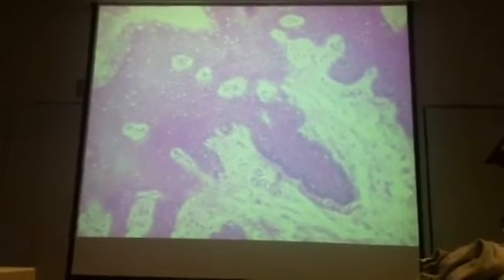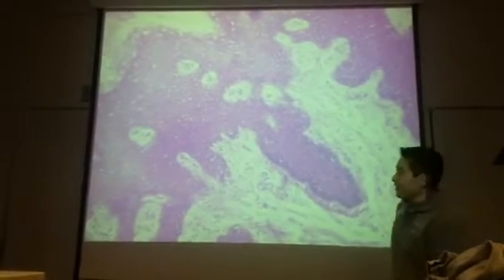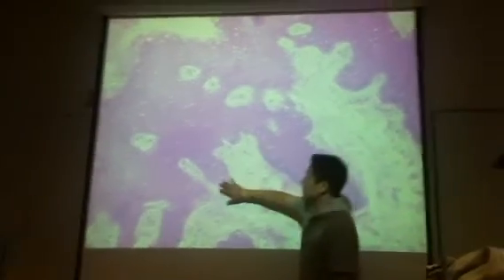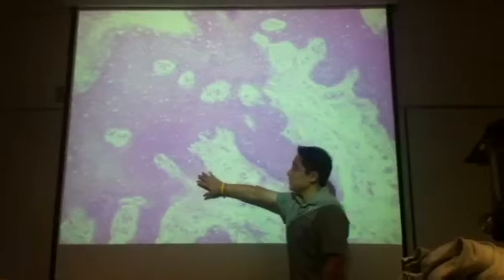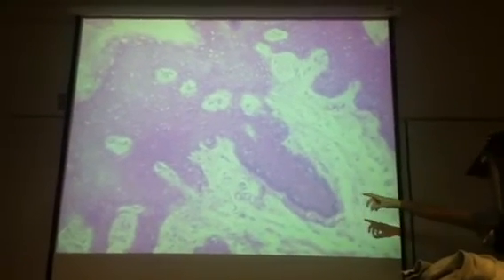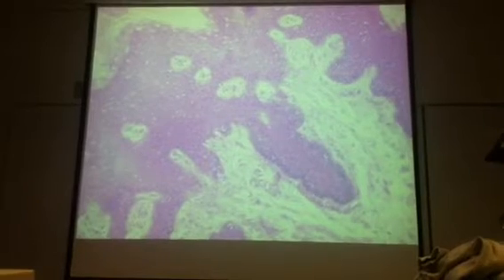They may have some lines like this. They are pretty difficult to find, especially on these slides — they're not as distinct. But they have that kind of spherical head-like structure, and then they have an extension coming out the back. And they recognize what type of stimuli? Light touch.